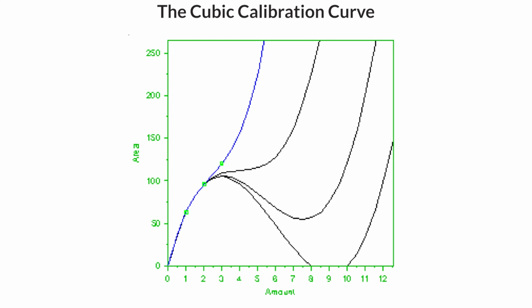The following figure shows an overlay plot of 4 cubic calibration curves, one identical to the above and the other 3 identical except that the highest point, not shown on the lower curves, has been moved to progressively lower responses. The second curve from the top has a nearly horizontal region, but no critical point. The 2 curves at the bottom turn over twice before resuming their upward trend. These curves do have critical points and the critical amounts are near 3.0.